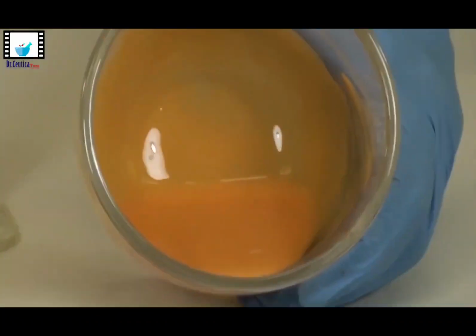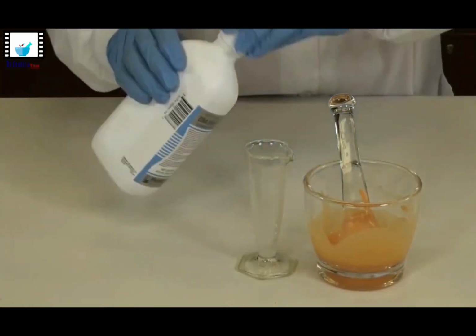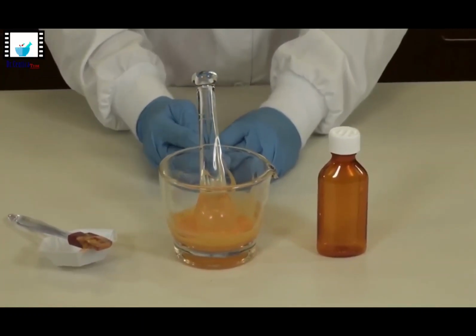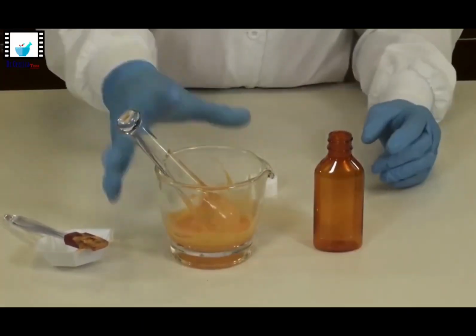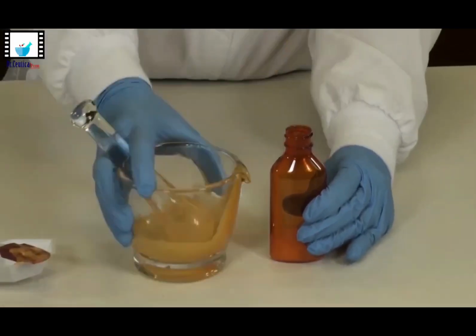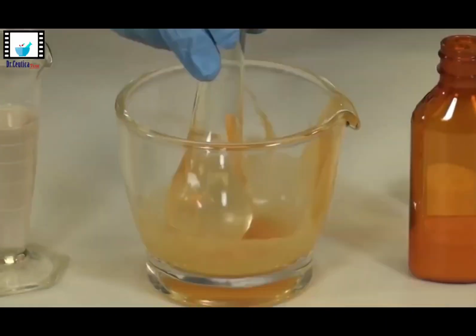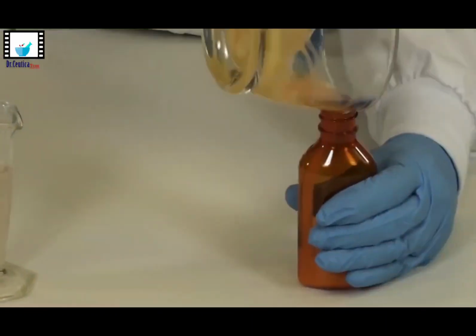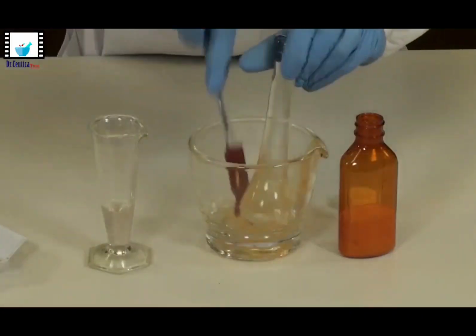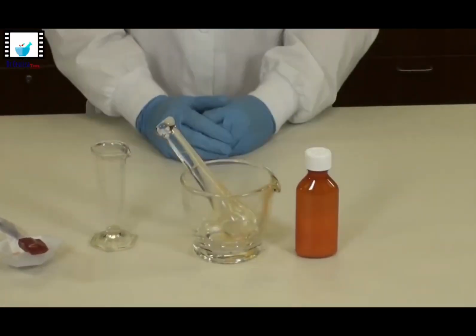The next ingredient we have here is the sweetening agent, and this is measured here by the same conical used for measuring the suspending agent. After measuring the sweetening agent, pour the suspension from the mortar to the bottle. Use the sweetening agent to rinse the mortar and the spatula, add the rinsings to the bottle and continue doing that until everything is clean. After finishing, close the container, shake well, and you are done.